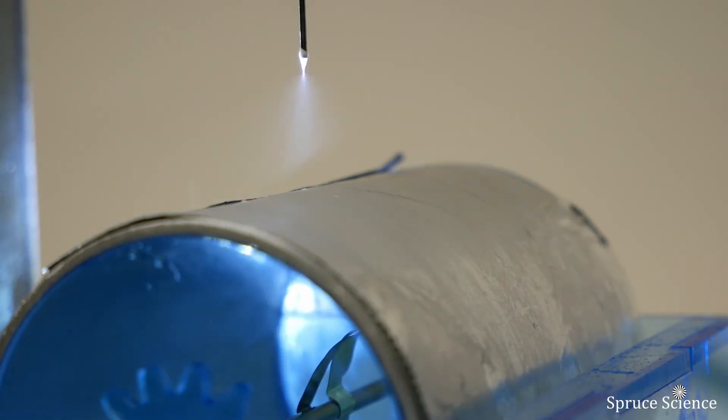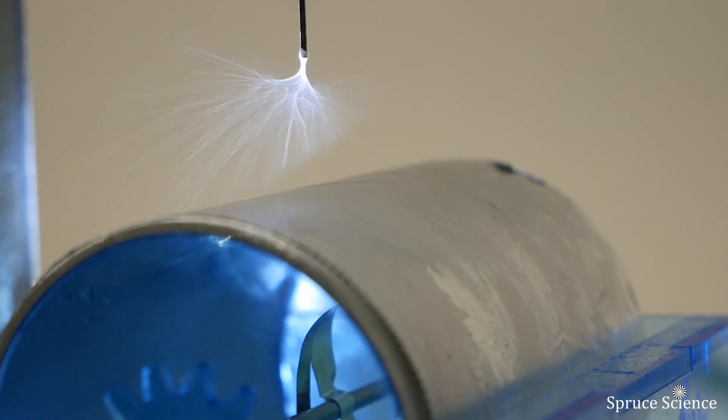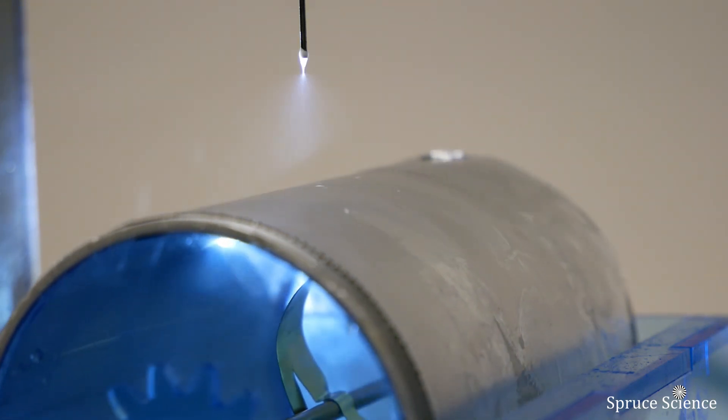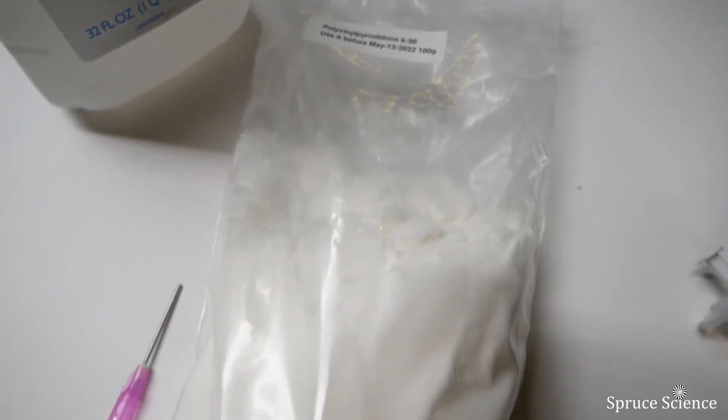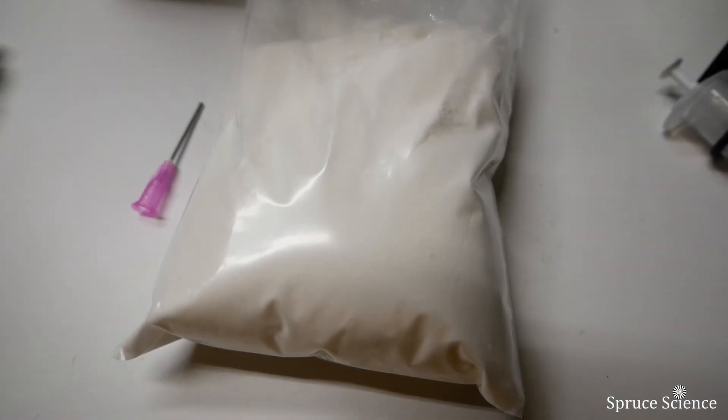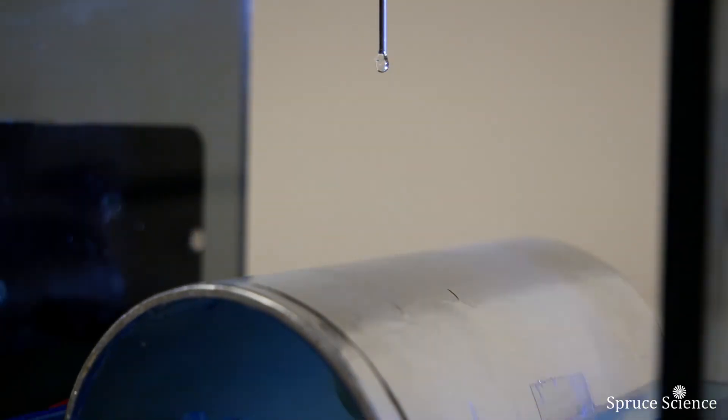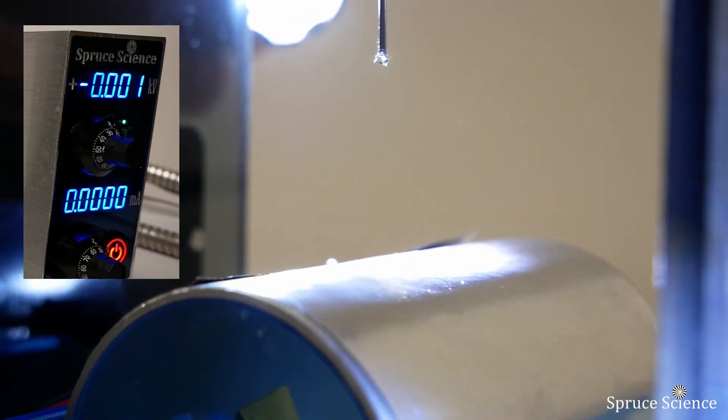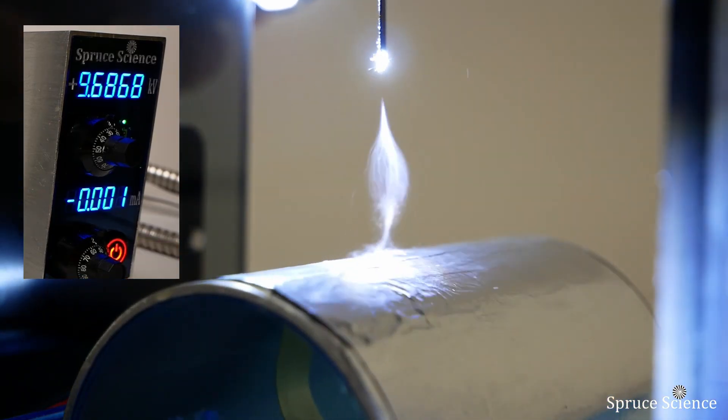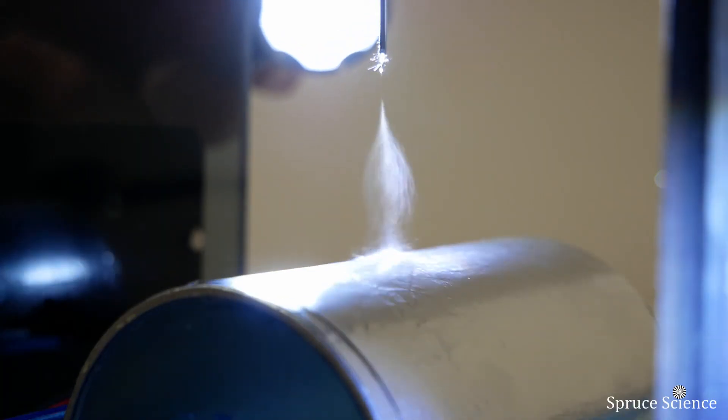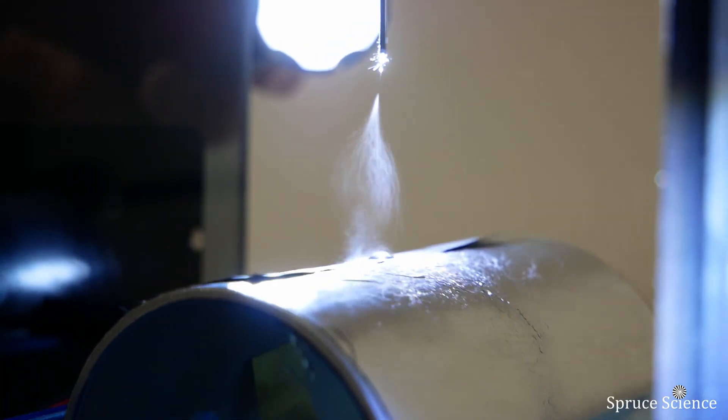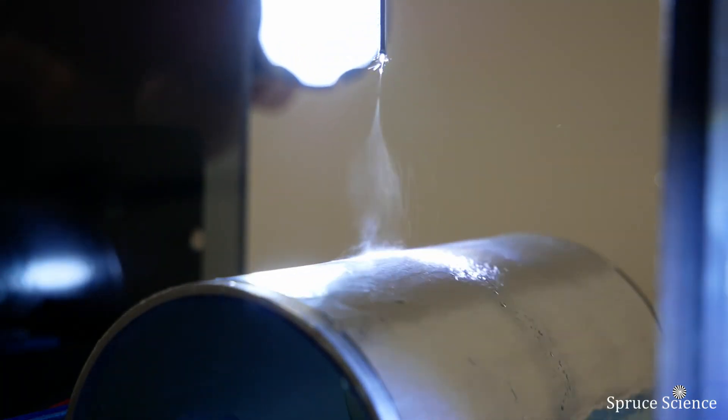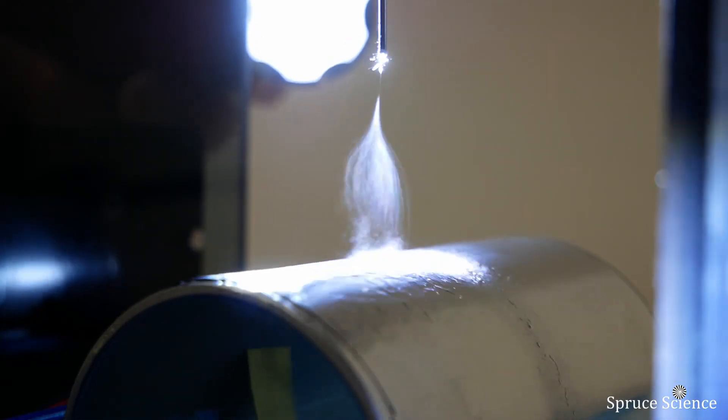Electrospinning is a fascinating fabrication technique. With a small benchtop setup like the one you've seen, you can do a lot of interesting research and development. Do you have a material you want us to electrospin? You can leave the material suggestion in the comment section below. For more information, come visit us at sprucescience.com.